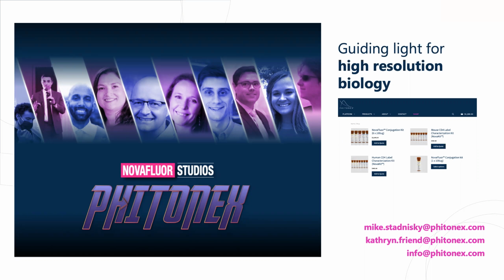I always go to Steve Perfetto and ask what's going on here, and no explanation. So I'm not going to have any luck understanding that either, right? Is there some sort of transfer from the autofluorescence to the beads, or... I don't know. But I'll pull that comparison data regardless, because I haven't looked at it in a while and it's important.